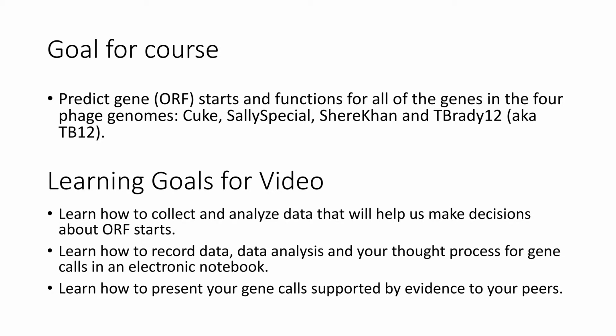So the goal for the course is for you to annotate the genome and determine all the most likely starts and functions for all the genes in each of the phage genomes. The goal for the 2 videos, part 1 and part 2, is for you to learn how to collect and analyze data that will help make decisions about open reading frame starts, and learn how to record the data analysis, and essentially your entire thinking process or logic for the particular call that you made for that gene, in an electronic notebook. And finally, by modeling how to present a gene call to you, I'd like you to be able to present your gene calls supported by evidence to your peers and to your instructors.